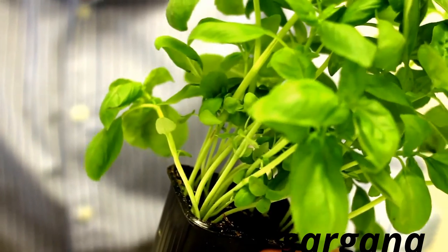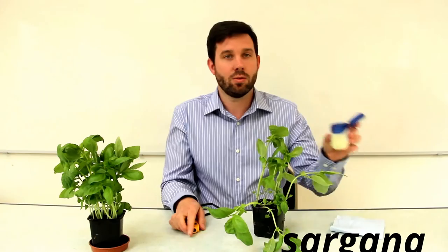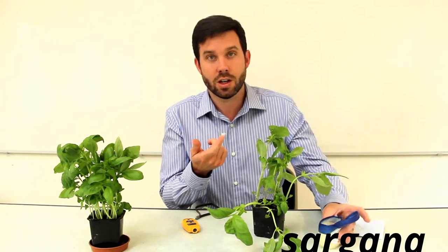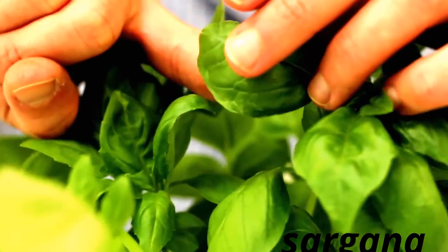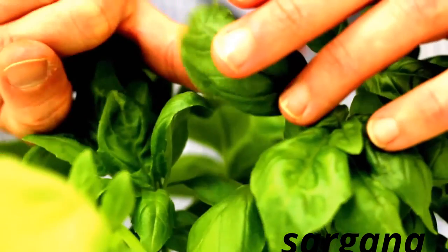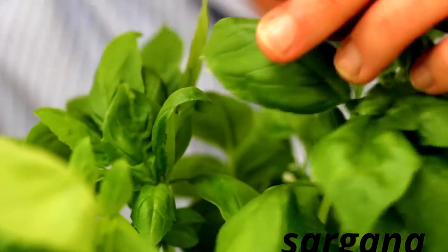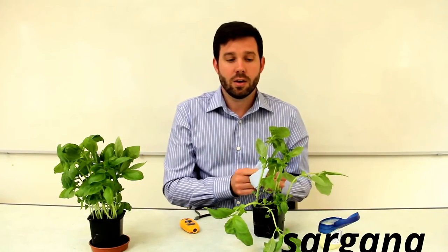What we're going to do is give students an investigation: what happens if we apply a film of petroleum jelly to the underside of a basil leaf? I'm using basil leaves today because basil plants are easily available from supermarkets all year round — you could also do this in your school grounds with a plant.